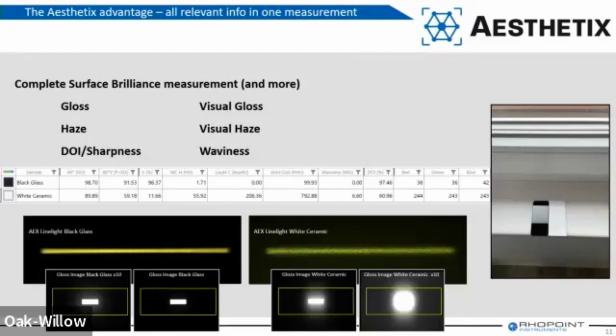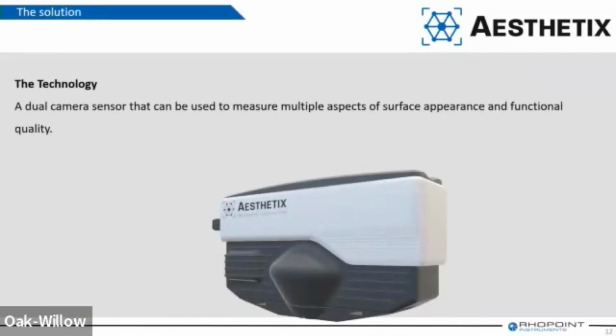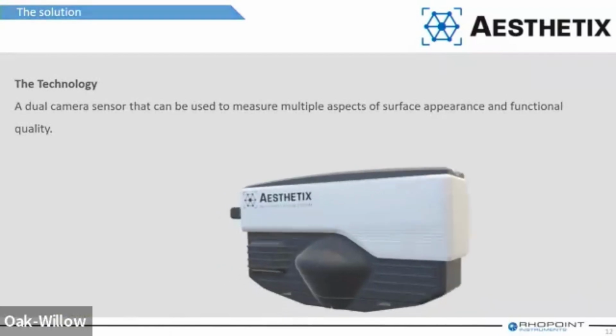These are the results from our instrument. So how do we do that? The best place to start, as we talked about imaging-based techniques, is using a camera, because a camera is very similar and it's designed to act like the human eye. We want to capture things the same way as we see them. So the device we've designed is a camera-based system.